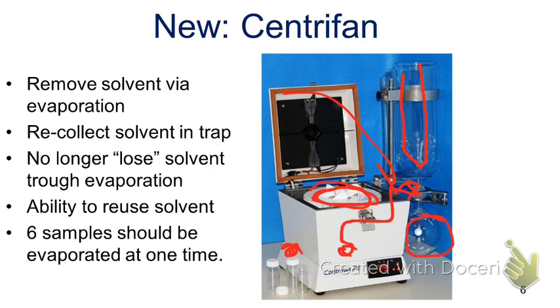But where does the rest of that air go? We've got a valve out the top, which will then come back into the instrument. Okay? What's special about the air coming back in? What does it no longer have in it? The solvent. Okay? Why is that important for us?